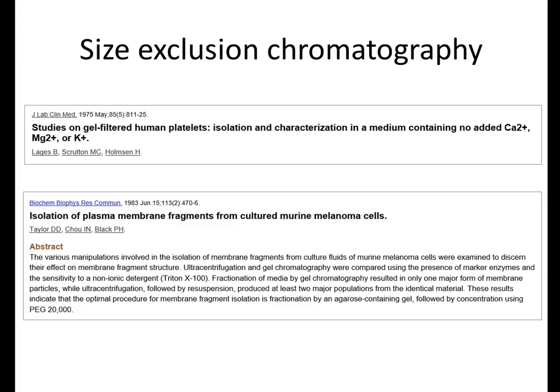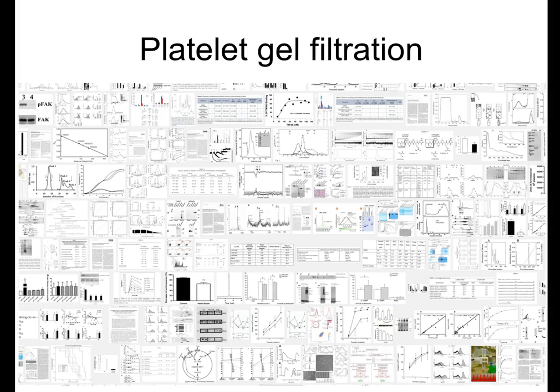This method has also been used in the past, illustrated by the paper of Doug Taylor, and a few years ago we started to use this method again. Just to illustrate how old and widely used this method is for platelets, if you go to Google and type in platelet gel filtration and look at pictures, this is what you will see. In numerous papers this method has been used in the past. So it's not a new method, but it's a sort of new or rediscovered application.